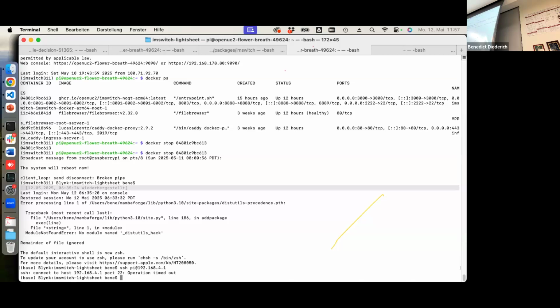Cool. The companies, so you're selling that as well? But yeah, it's a cool thing. We track like the whole swirl.